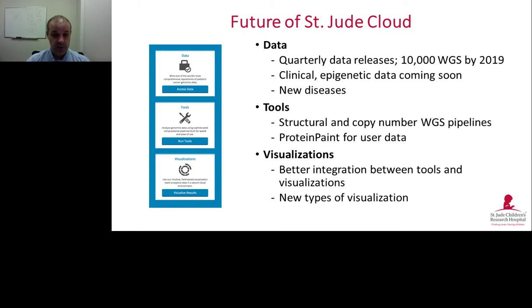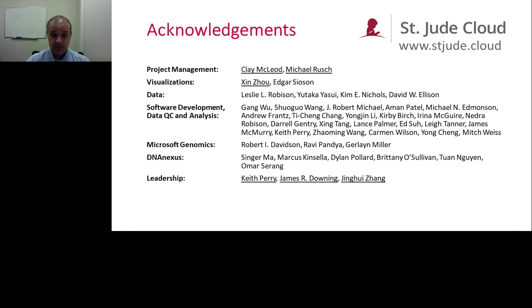And we'll be improving the integration of our protein paint visualizations with user data, so you can generate the same visualizations that Clay showed with your own data at some point in the near future. Also, there will be several new types of visualizations, so watch this space.